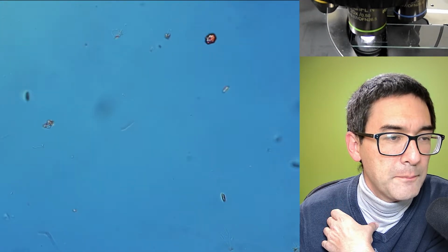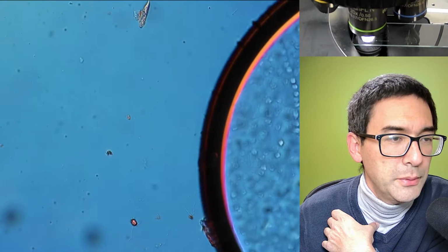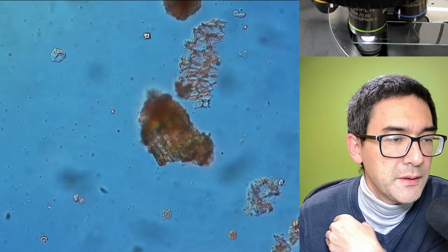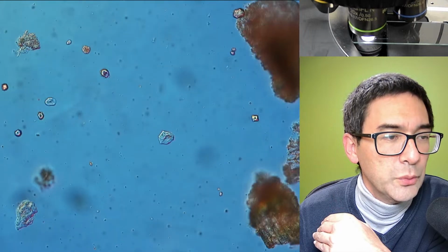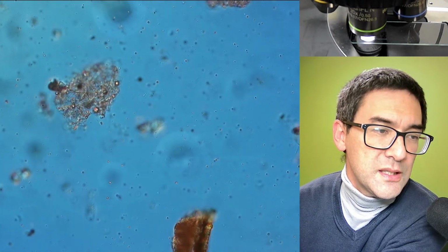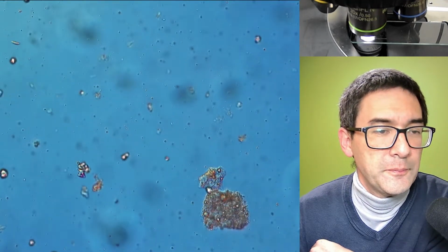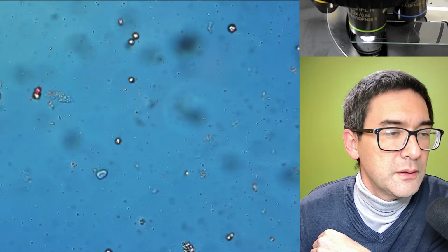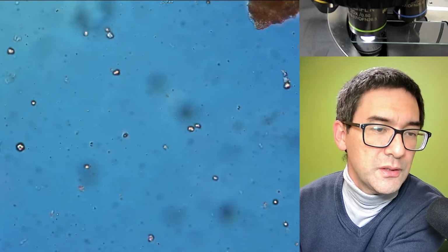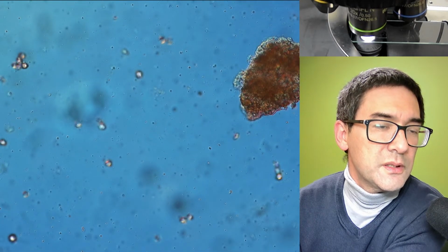So the further away, there are more of them here. And here at the top, okay, there's an air bubble in the way. And now it could of course be, here's one. It could of course be that they're less there because of the movement of the fluid, that this kind of flushed them away. This can of course be the case, but this one over here is now in the concentrated area. They start to move back and they don't seem to mind. They don't seem to mind, unlike the paramecia, they didn't like this at all. Yeah, they started spinning first. But these actually seem to be doing fine.